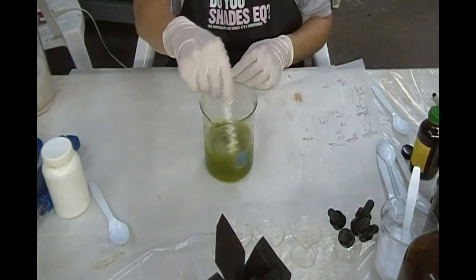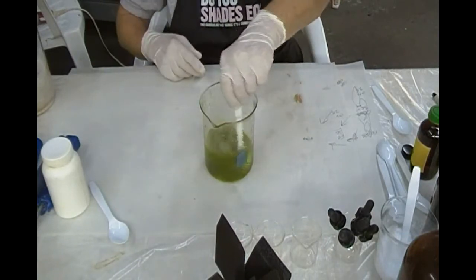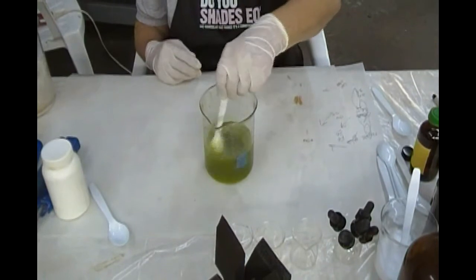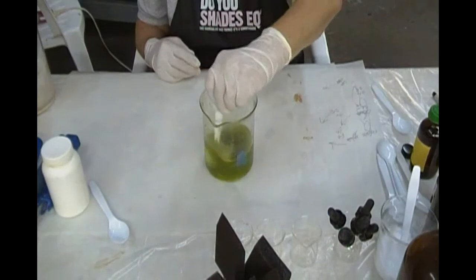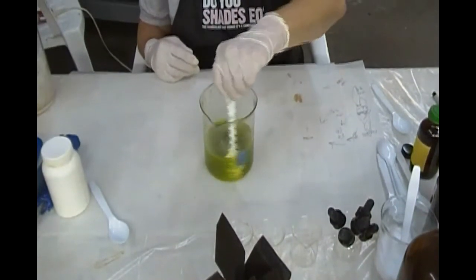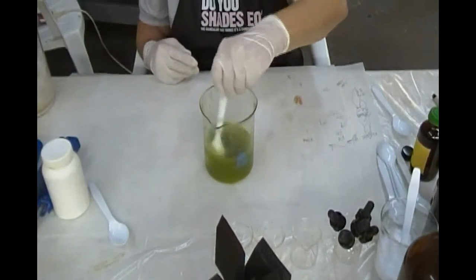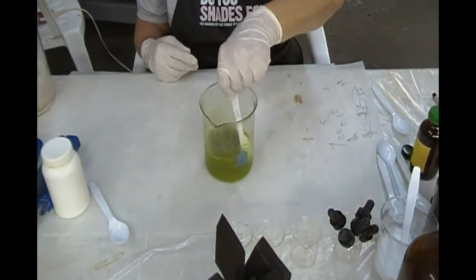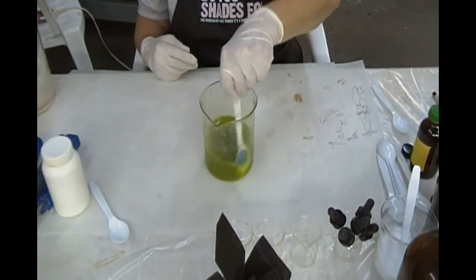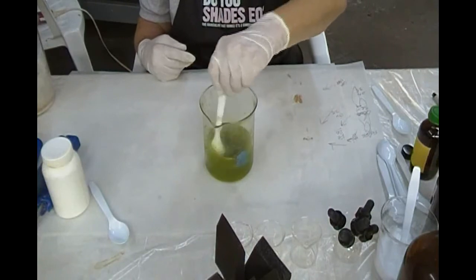The formulas that we're using come from an old source. This old source calls for making a stronger-than-normal solution, letting it sit overnight, and it will form crystals, because this is a super-saturated solution and it will crystallize out. At this point, we have not been able to run a series of overnight tests to determine exactly what these are, but we do use a concentrated solution.